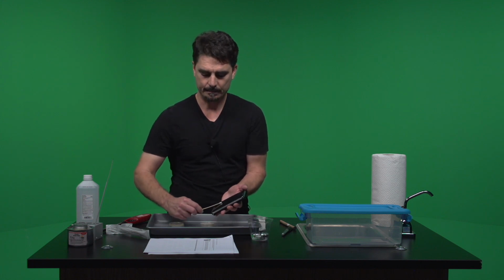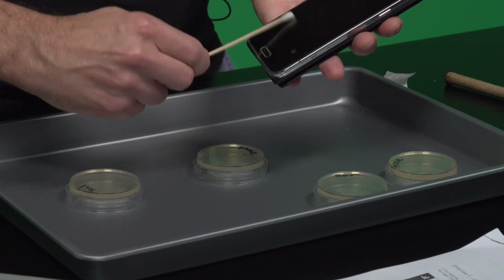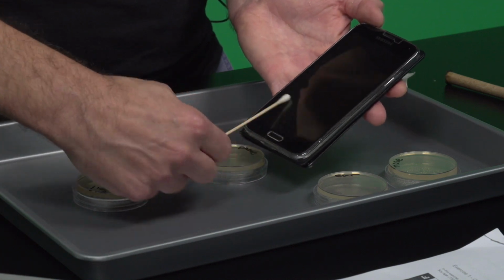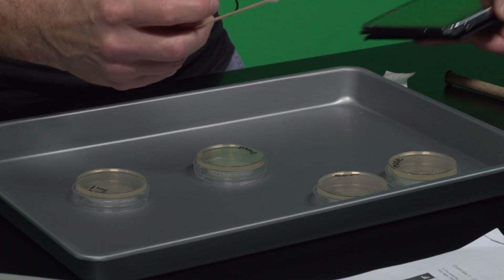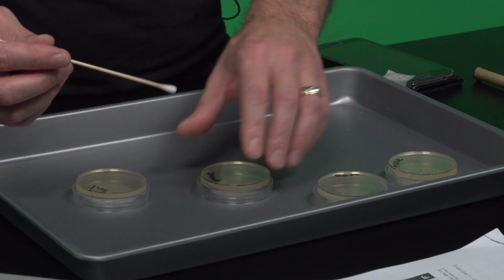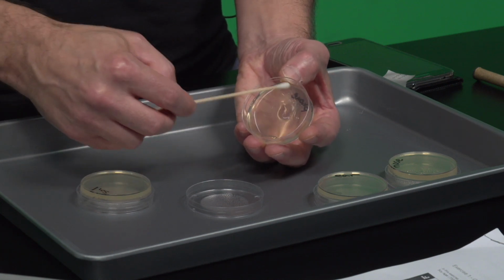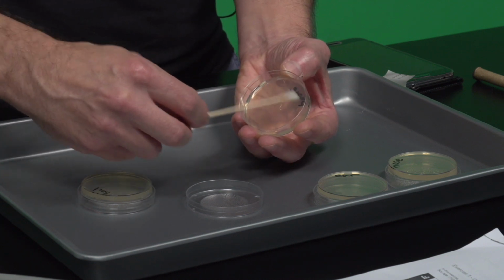So I'm going back and forth. I'm swabbing it around. Just like you're cleaning it, you want to pull all the microbes off of the surface. And now you don't want your swab to dry, so don't do it too long. Another way you can work with this, instead of the way I did it before, is you can just do this really quick. Now that does open you up to perhaps more contamination, but sometimes, especially when you're just starting out, this is a whole lot easier to do than trying to hold the lid at the same time.